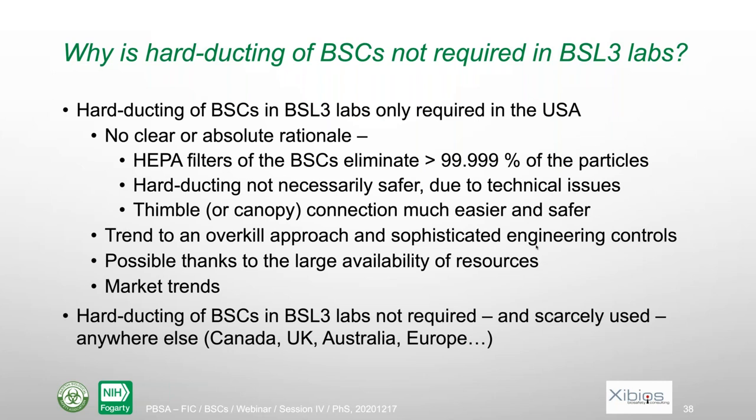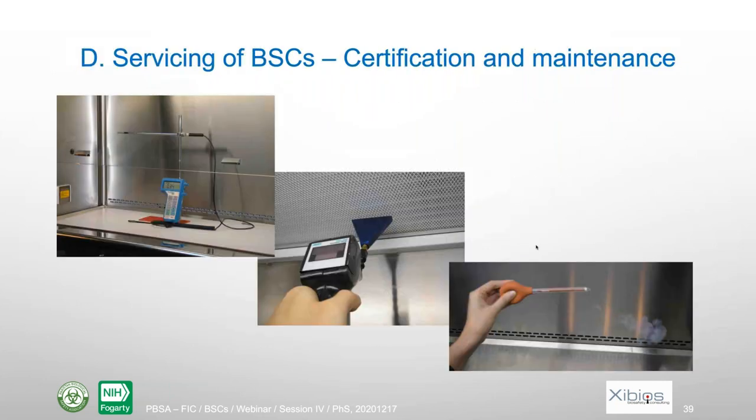I give you some information there, but I will skip this one because we need to spend a little time on some more important slides. So biocertification and maintenance.